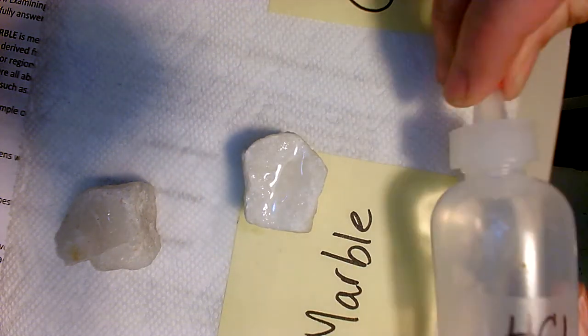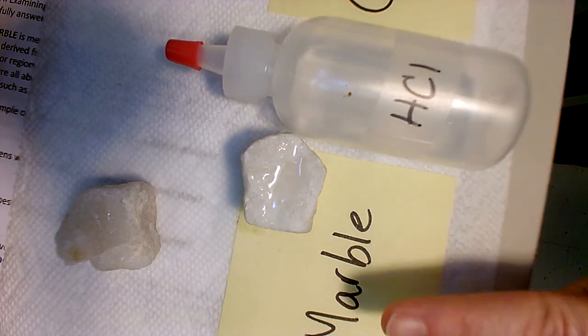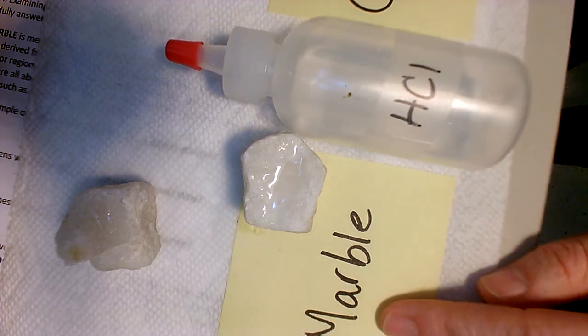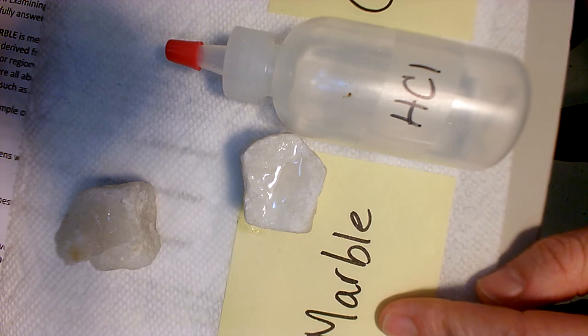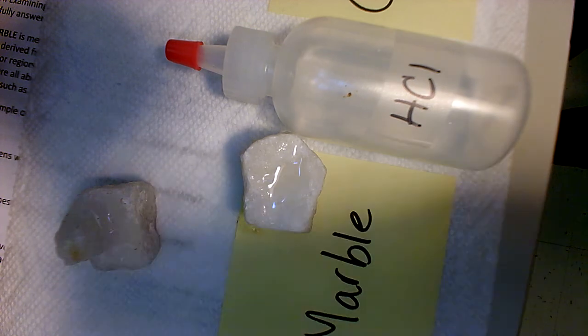So in conclusion, marble does react with the hydrochloric acid because the parent rock of marble is limestone, which is made out of calcite. And you probably remember that the mineral calcite is a carbonate rock and it reacts with hydrochloric acid.